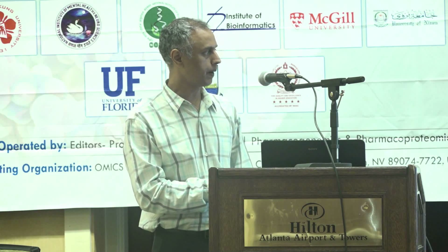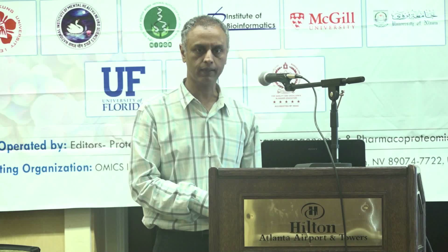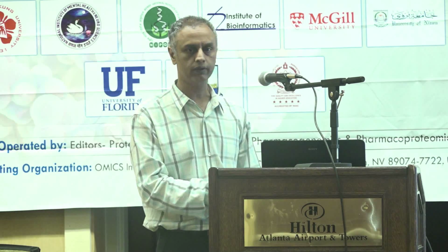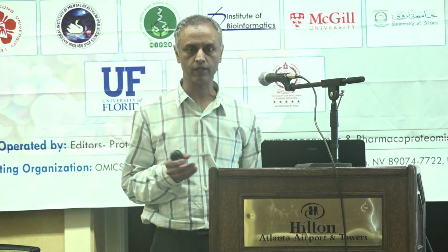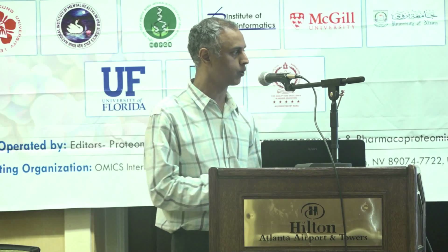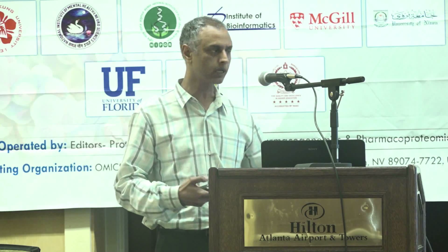And then when we use a peptide that is made by Mycobacterium abscessus, but not MTB, we see it in these 2 samples, but not in the others. So using a targeted fashion, you can maybe build these plus-minus assays much more readily rather than mass spec sequencing based.